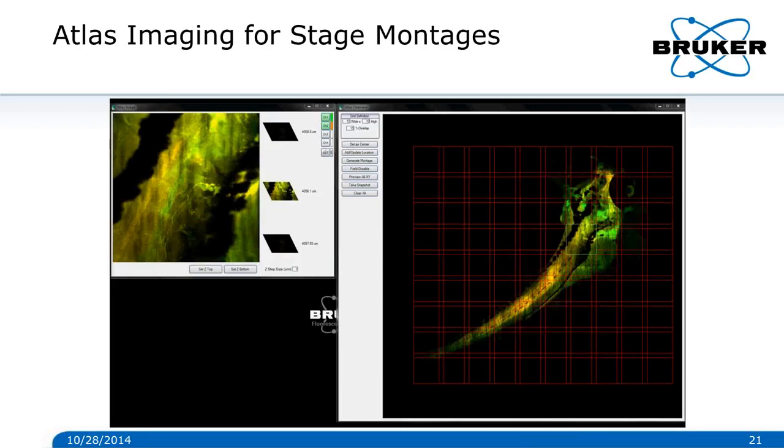easily. And also, something we've been able to do with the application, which I'll show in a minute, is to allow people to only acquire data from the area where there's actually specimen available, or specimen apparent.